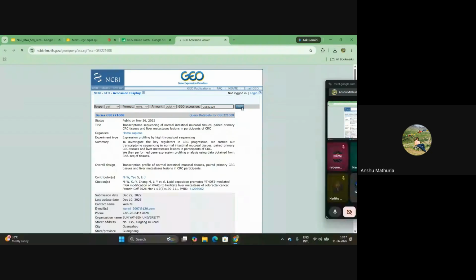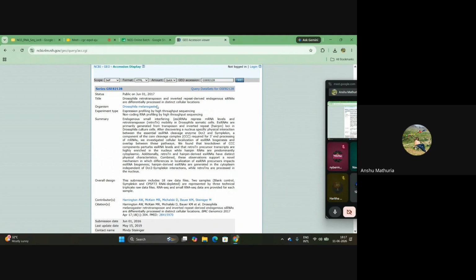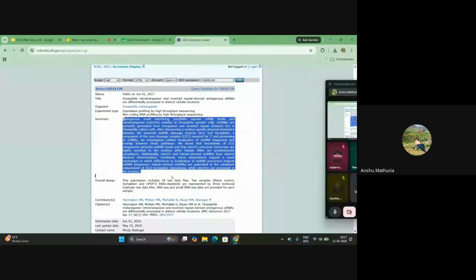So now here you will get the study. The study was done on Drosophila. What is the study title, and what is the summary? Basically you will get to understand what this study is doing and what parameters this particular study uses, for which we got the data sets.